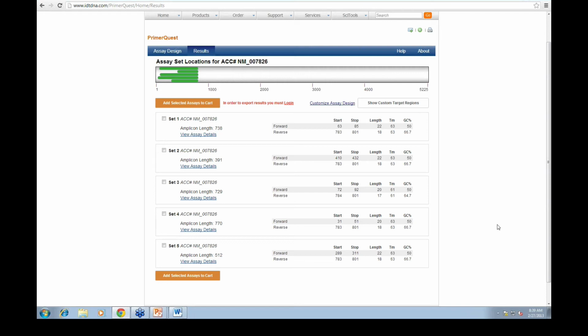But basically, you would have different dyes on each of those, and based on the amplification you see, the height of your 2 dyes in contrast to each other would be the way that you determine the amount of mutant versus wild type you have in your sequence.